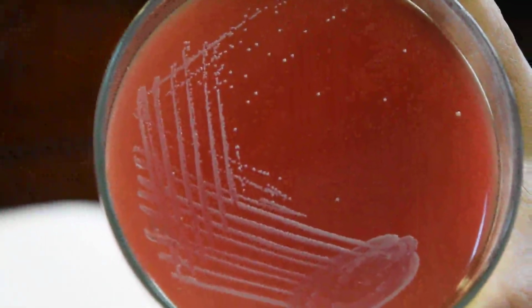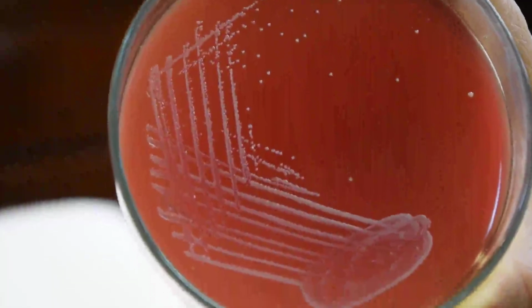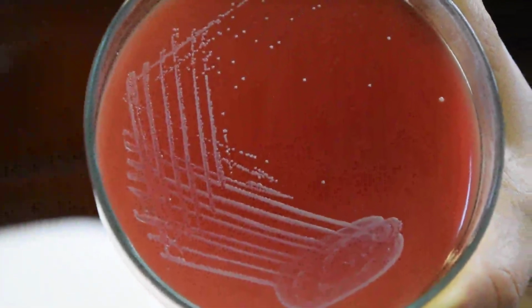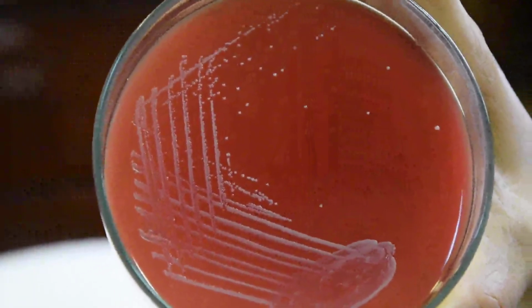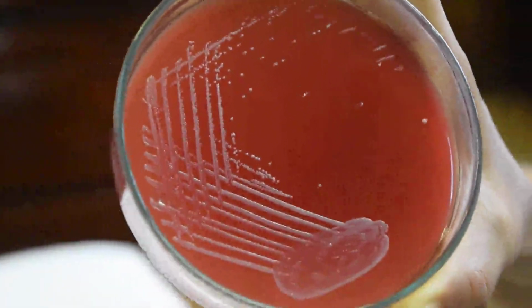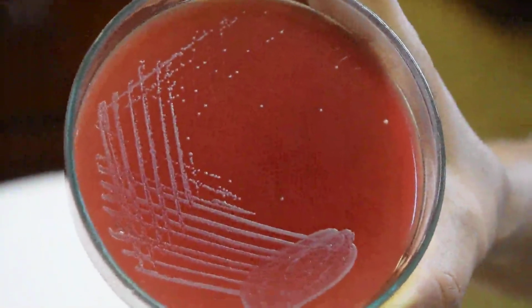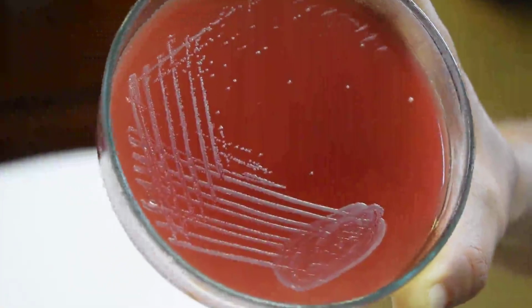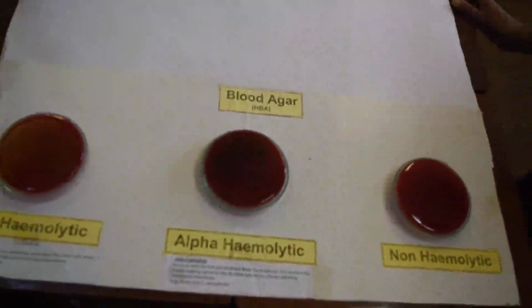The examples are group D streptococci. Group D streptococci include Enterococcus, and Streptococcus bovis, different organisms. These organisms don't show hemolysis around the colonies. So depending on the type of hemolysis, we can use the property of hemolysis to identify different streptococcus.